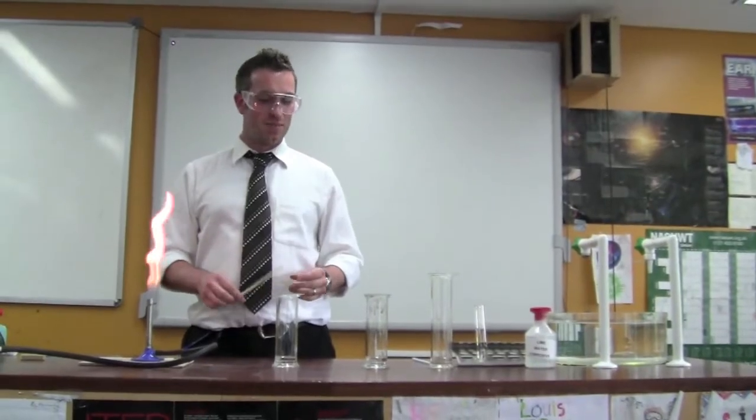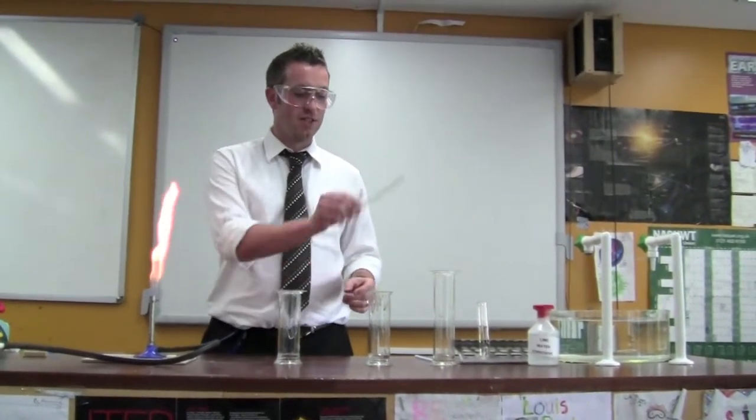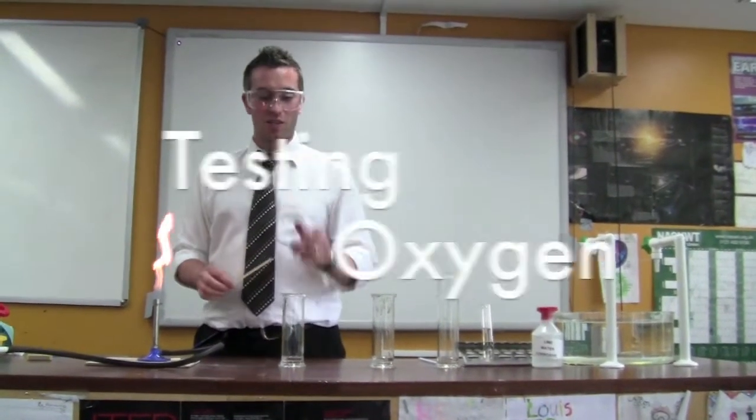Now we're going to show you how to test the different gases. We have oxygen, hydrogen, and carbon dioxide. We're going to start with oxygen first.